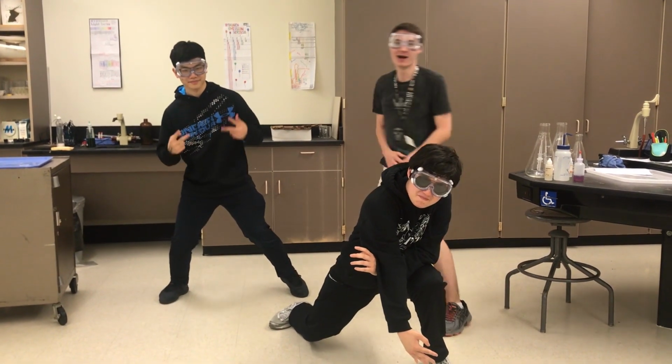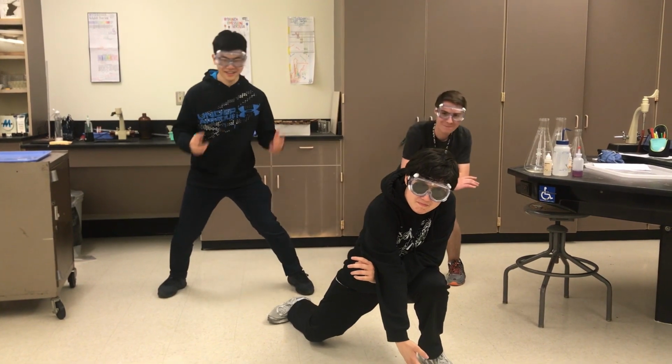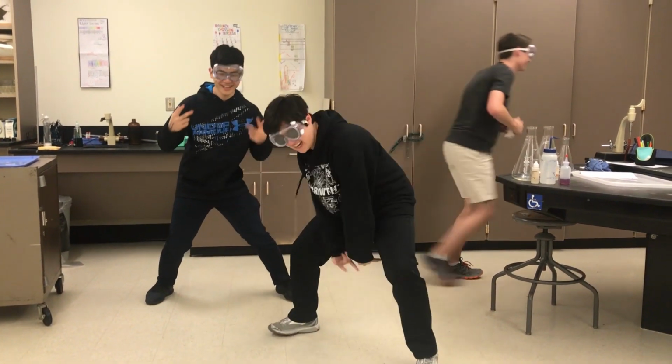Today, we're showing you a lab. In this lab, we're going to be showing you how to find the concentration of consumer-grade hydrogen peroxide. Let's go!